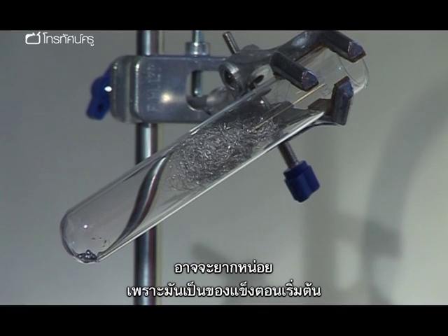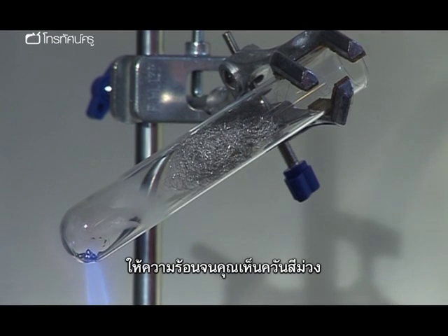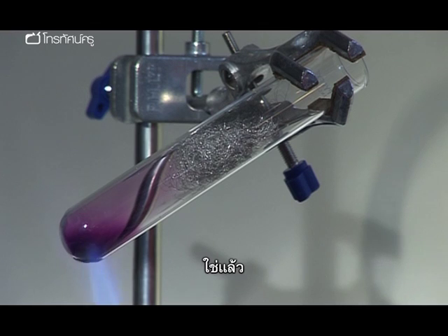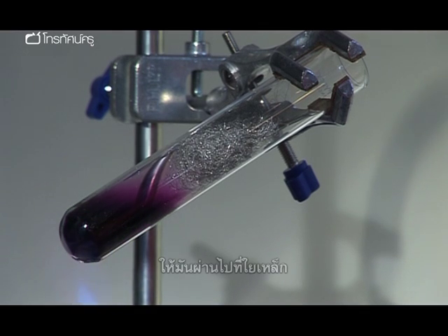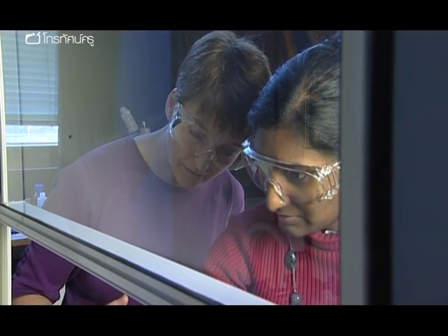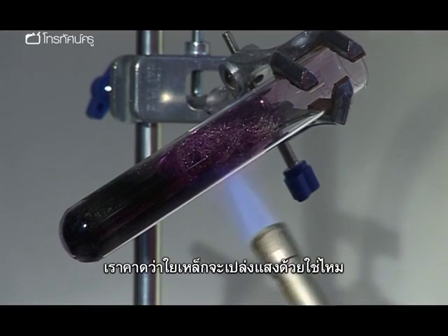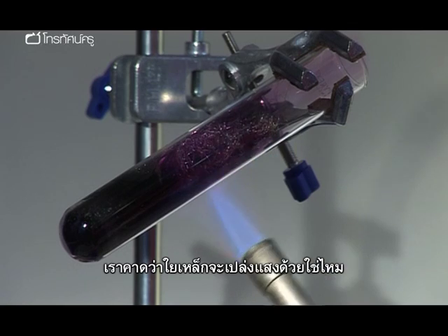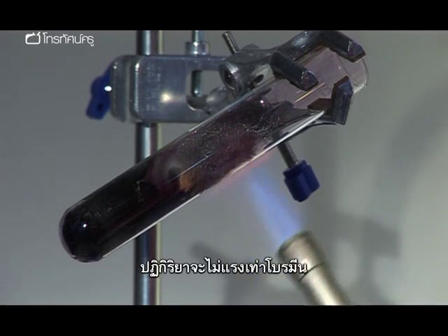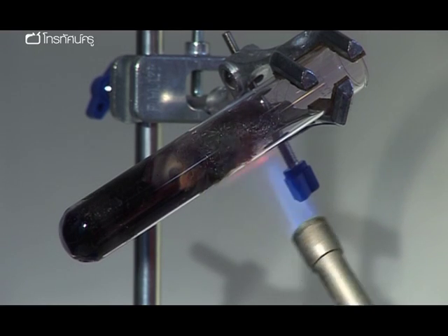All you're going to do this time is just warm the iodine up. It's a bit more difficult because it's a solid to start with. Just warm it up until you see the purple fumes, purple vapour. That's it, and let it go through the iron. That's it, just gently heating it. Are we expecting the iron wool to glow as well? It'll glow, but it won't be as vigorous a reaction as with the bromine. Oh, you can see it happening now.